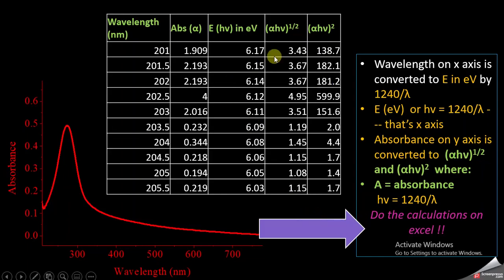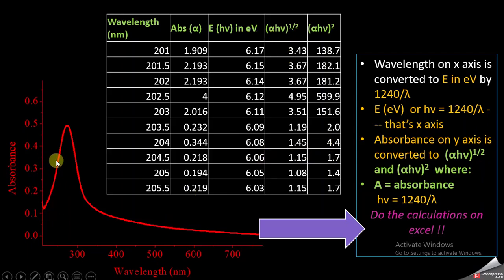You can also do all these calculations in Excel very simply by applying the formulas, and all your wavelength and absorbance data can be converted into these values. Now let's see what happens when we convert this spectrum and data into the direct band gap Tauc plot and the indirect band gap Tauc plot.